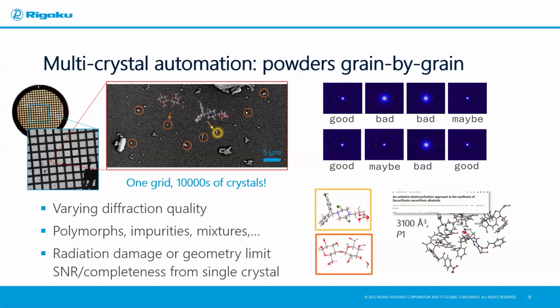And then there are cases like in this one where you have a low symmetry, where it becomes tricky that the tilt range of a goniometer in ED is usually limited because of the small geometry of the instrument, but also because if you have something that's very radiation sensitive, you only can use tiny doses, get small signal to noise ratios, and you need to merge many crystals to get a good enough compound signal to noise ratio for a good structure refinement.